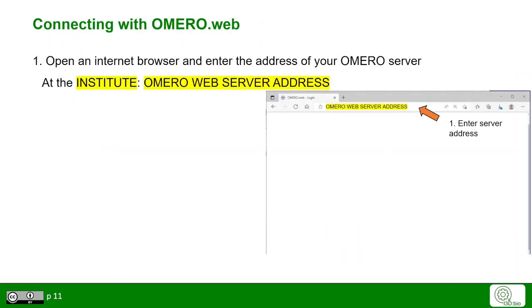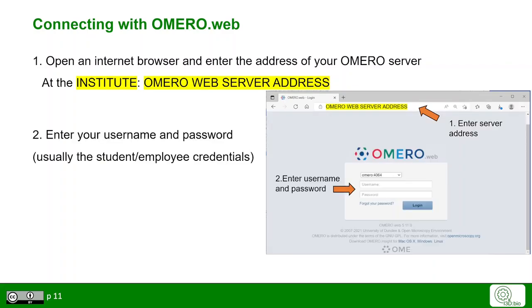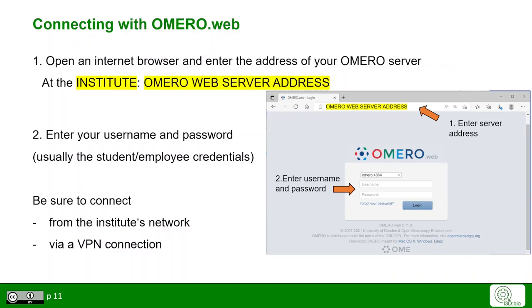To connect to Omero with OmeroWeb, open an internet browser and enter the server address of your Omero server. Click enter to see the OmeroWeb login window. Please use your user credentials to log in depending on your institute. In many institutes, Omero might be only available if you are within the institute's network or connected with a virtual private network connection.